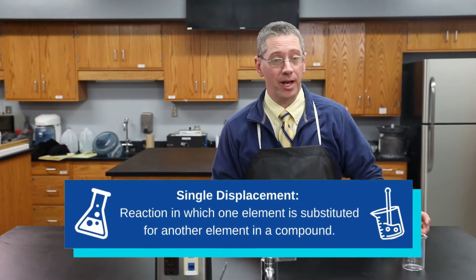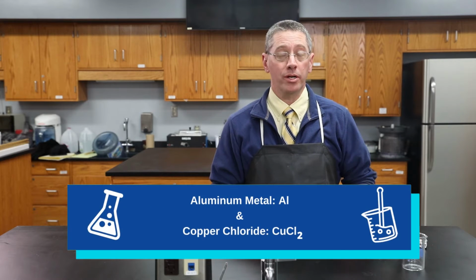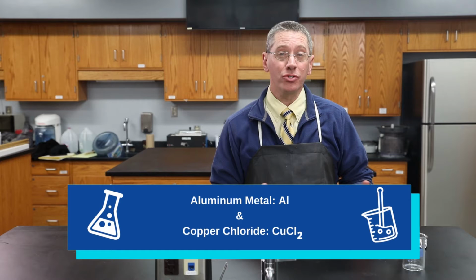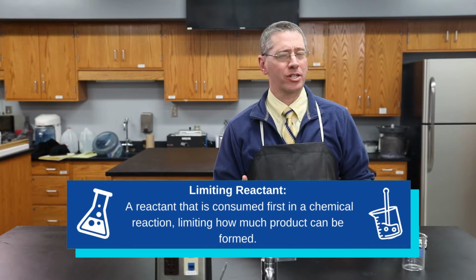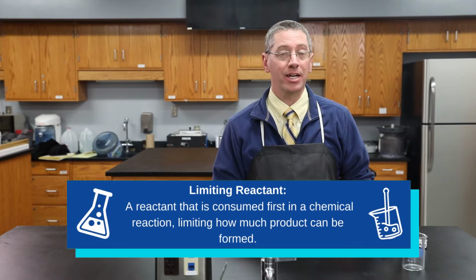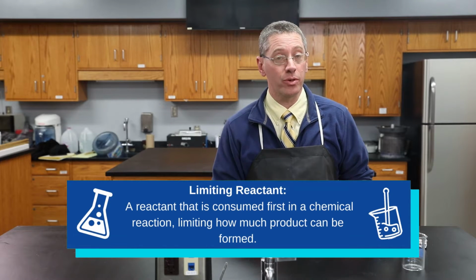A single displacement reaction between aluminum metal and copper chloride will work until you run out of one of those two reactants. And that's called the limiting reactant. In other words, the reaction will last as long as it can until one of the two ingredients gets used up. And that's exactly what we're going to do now.